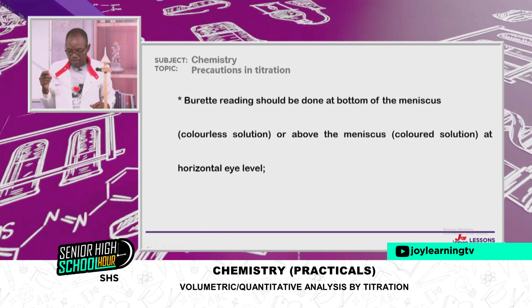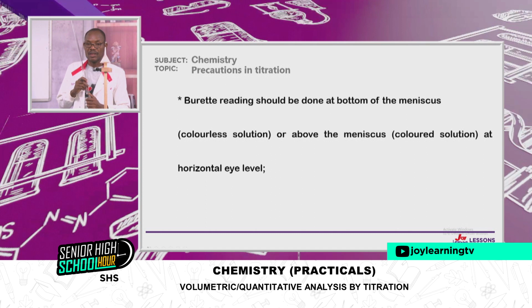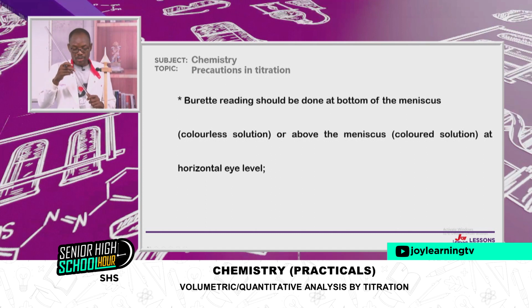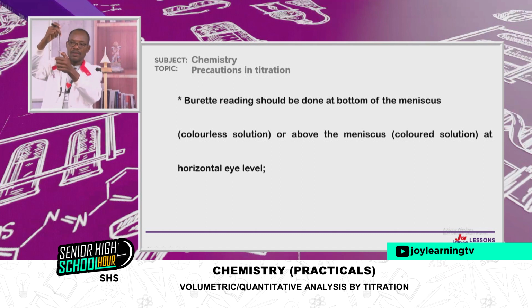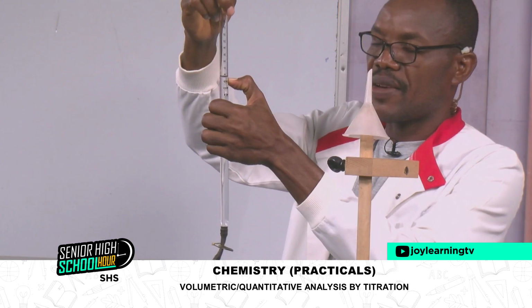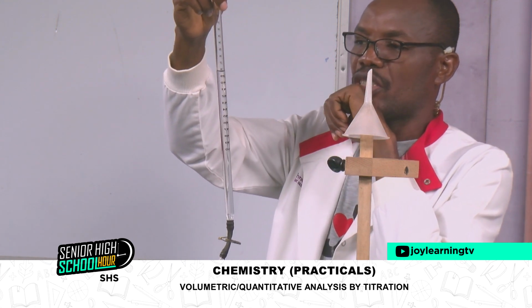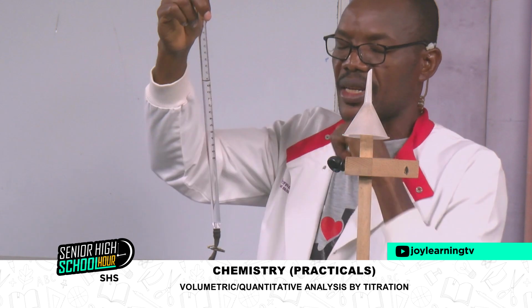Burette reading should be done at the bottom of the meniscus for colorless solutions. So it forms a curve. You read at the bottom of the curve, where the bottom just touches a calibration on the burette. That is where you take the reading.